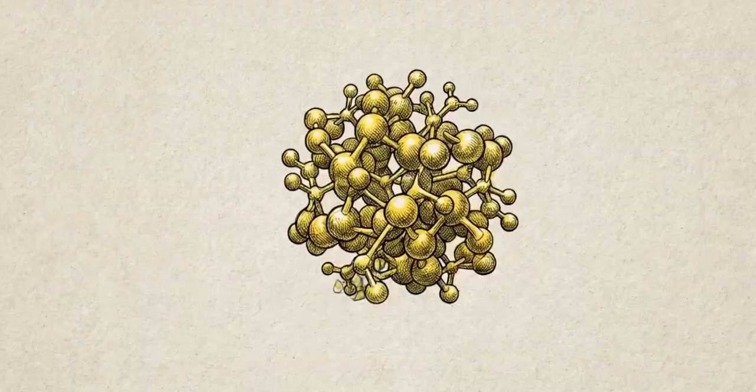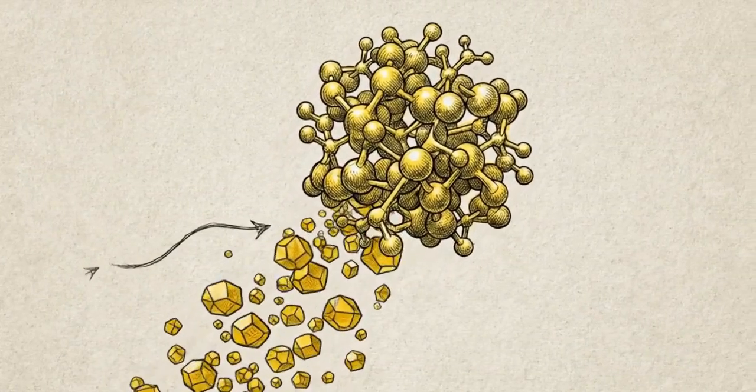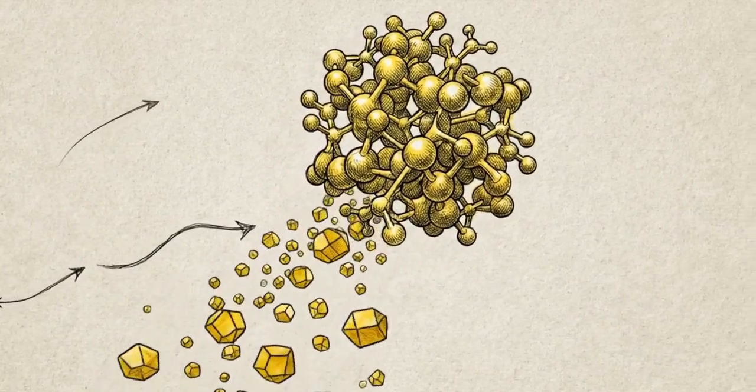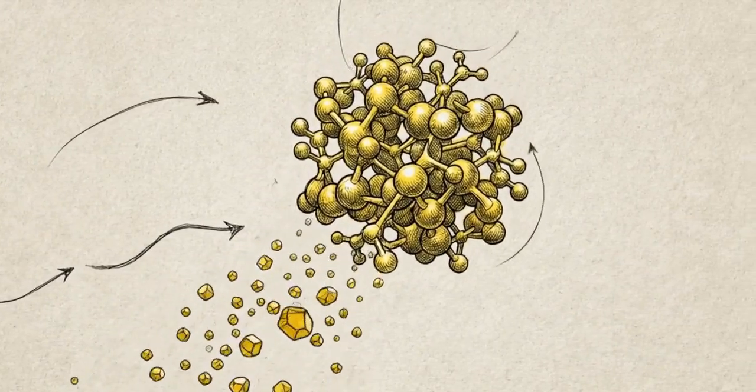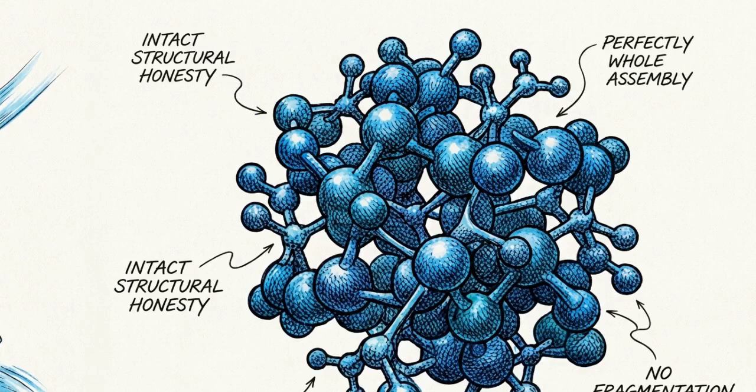The target molecule is then pulled into the mass analyzer, free of its solid casing, carrying an electrical charge and experiencing almost zero fragmentation. By tuning the laser directly to the matrix and not the sample, the matrix takes the entire energetic hit. The biomolecule is carried along for the ride, completely safe.